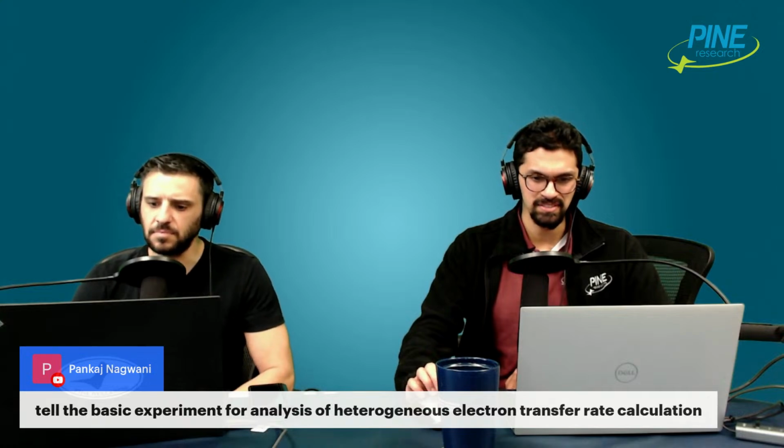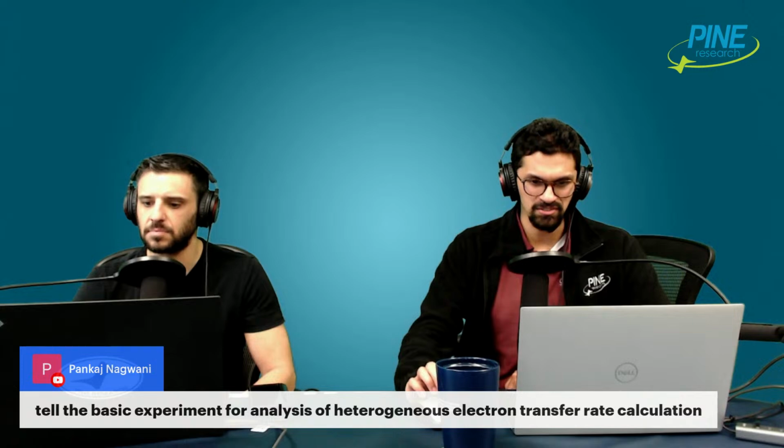All right, let's see. There was some Daniell cell talk, which we already went through. There's one from Pankaj. Pankaj is asking: tell the basic experiment for analysis of heterogeneous electron transfer rate calculation. Hey, this is right up your alley. We did talk about the exchange current density.